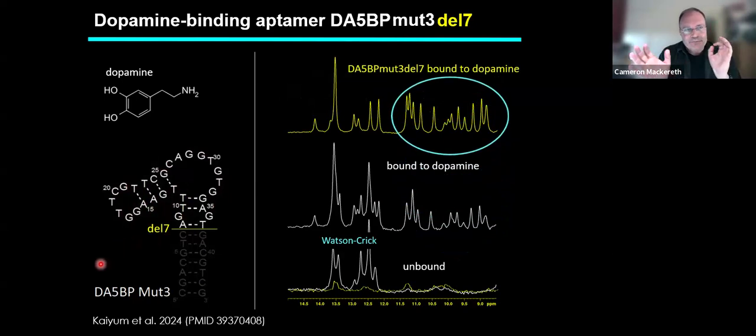Now, to do NMR spectroscopy, there's lots of peaks. In order to analyze these signals, you have to eventually figure out which signal is which atom. And the whole thing just becomes a lot easier if you can somewhat minimize what you're looking at.